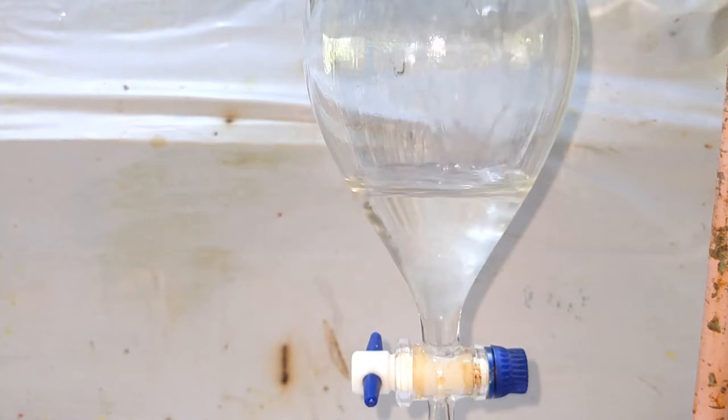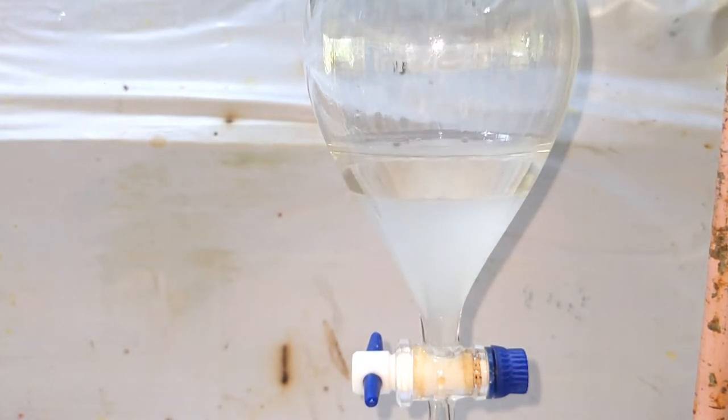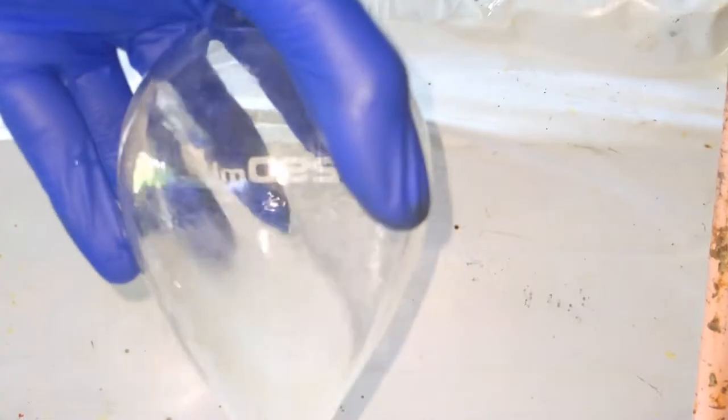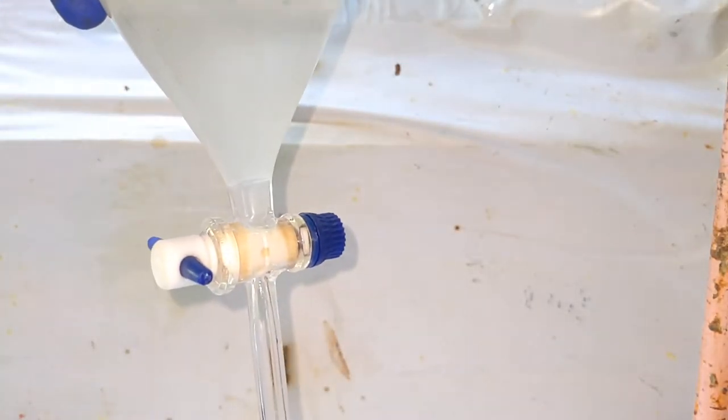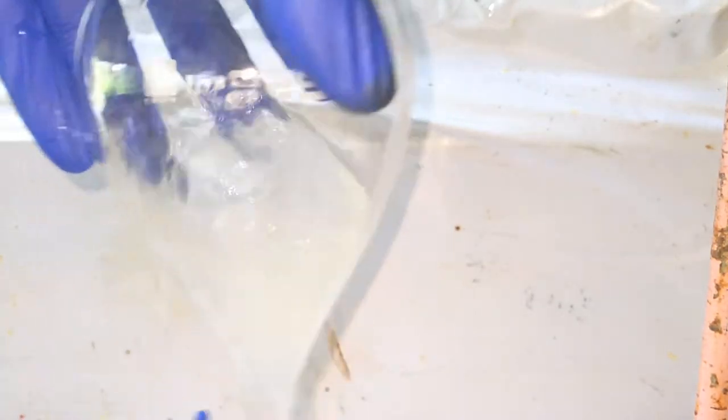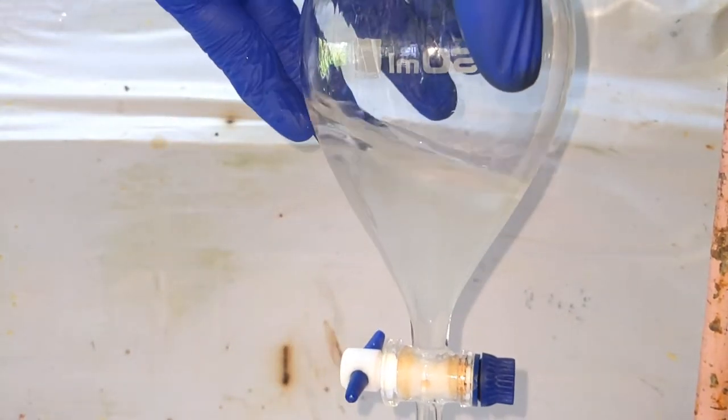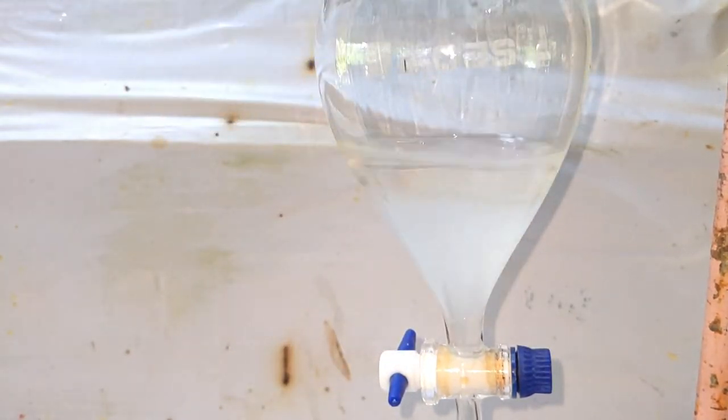A second washing was done with concentrated sodium bicarbonate solution, and this would ensure that the remaining acid would get neutralized. After adding the sodium bicarbonate, the separatory funnel was shaken vigorously to make sure that the organic layer completely mixes with the sodium bicarbonate solution.